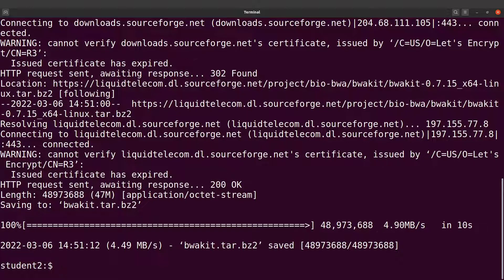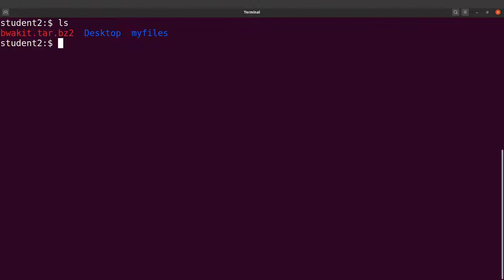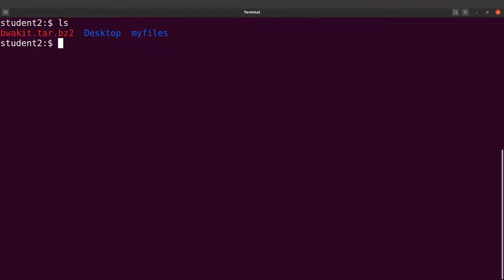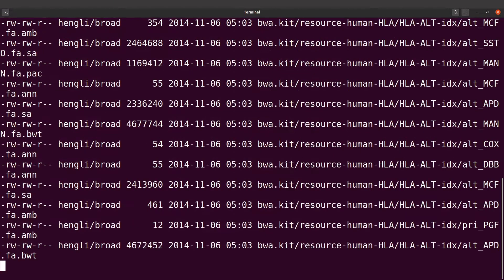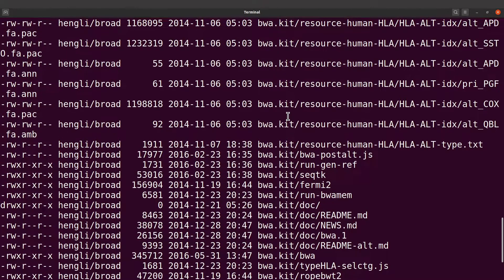The download is done. Let's do an ls and you can see the file there. There are other utilities included, but our interest is in samtools. I need to get the contents of this file first, so we use tar. We say tar tvf and then specify the file — this gives us all the contents of this particular archive.